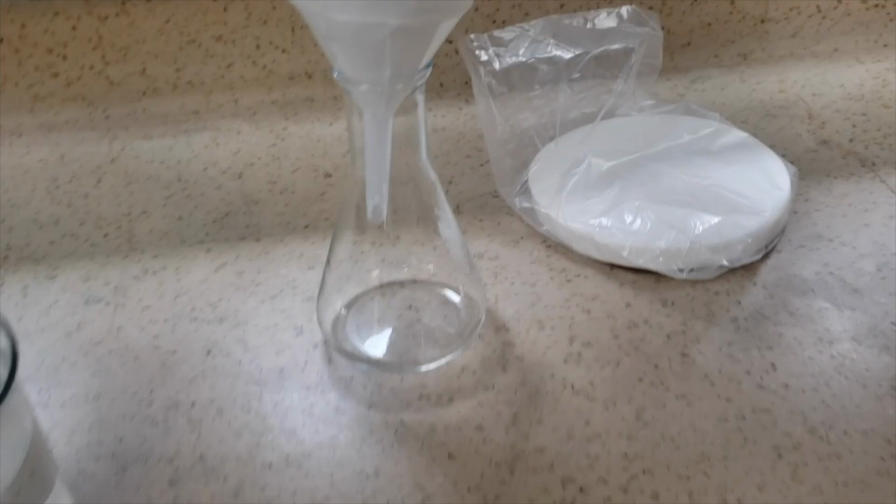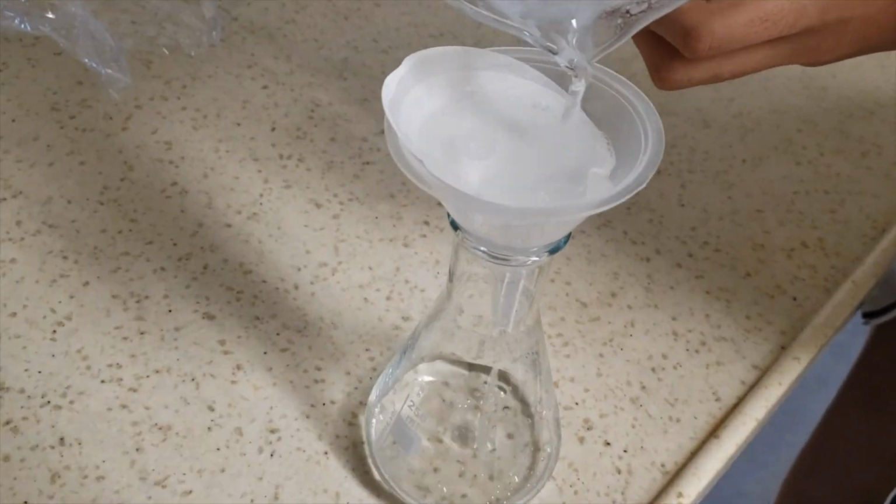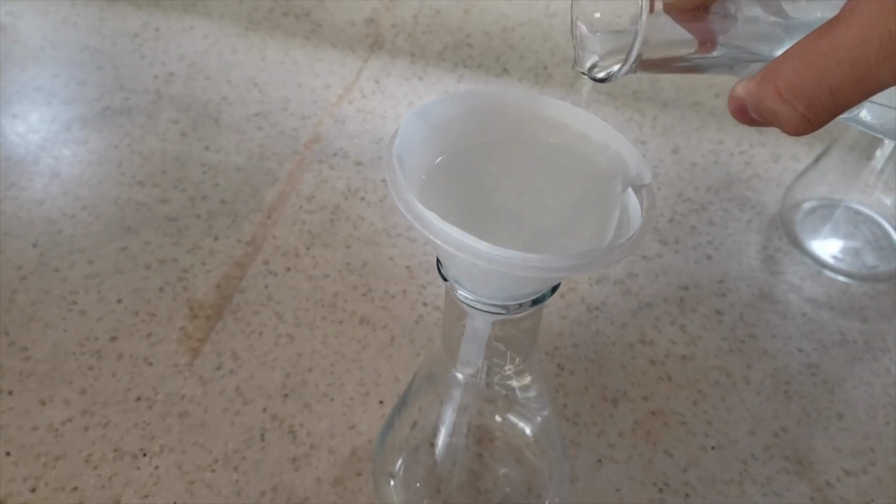Now, since filtering everything will be a nightmare, we just waited until the next day when everything sank down to the bottom, which can then be filtered fairly easily. The magnesium phosphate part went about the same, except when the solution came over, it went a little bit cloudy in the end. But then we just put 2 layers of filter paper and everything became clear.